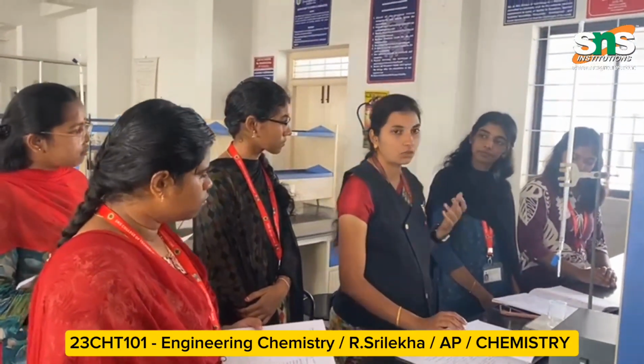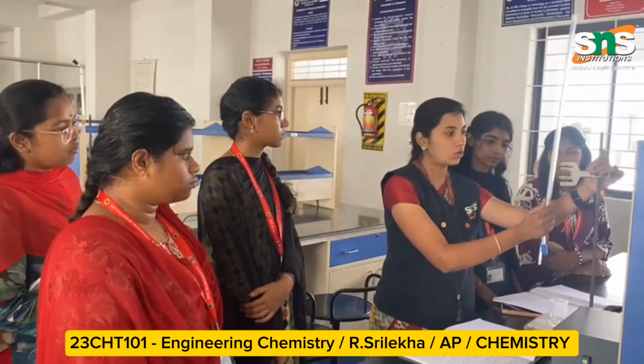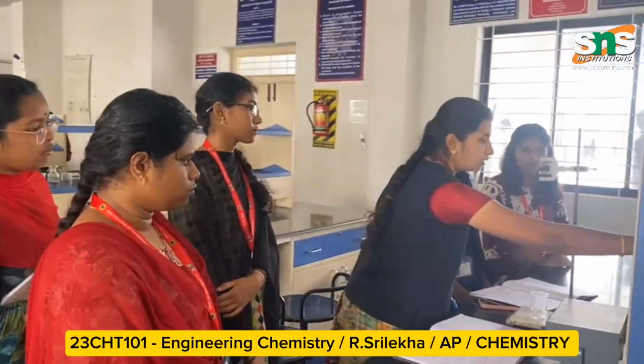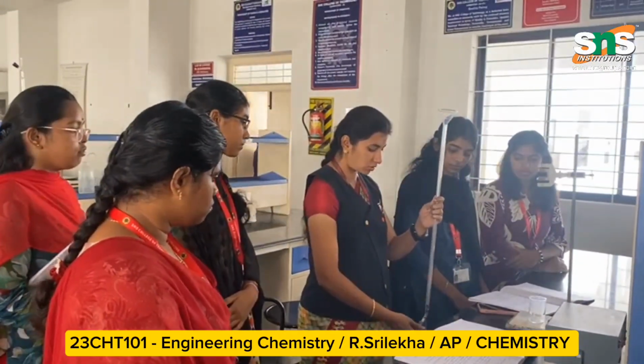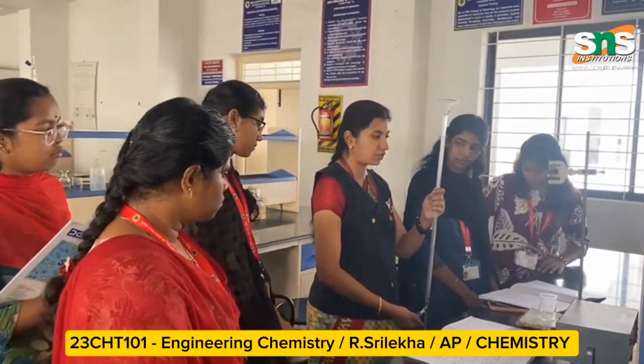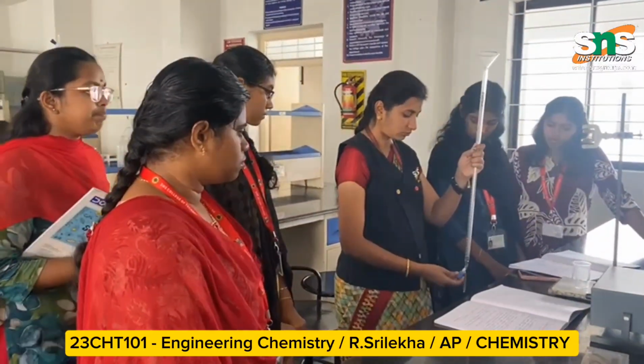Okay, so with this we are going to check the burette solution of sodium hydroxide. Now I am adding sodium hydroxide to the burette and reading the lower meniscus of the burette solution. We have to check whether the burette stop cock is closed.